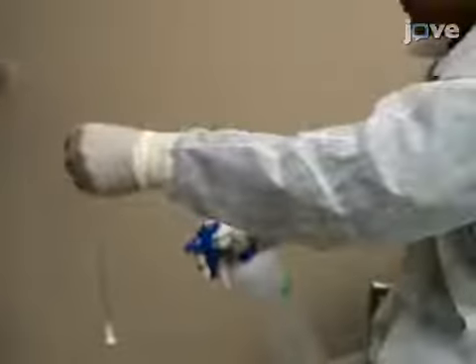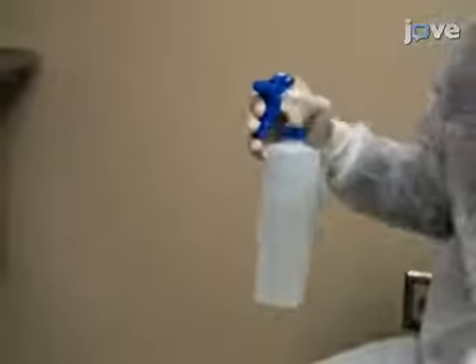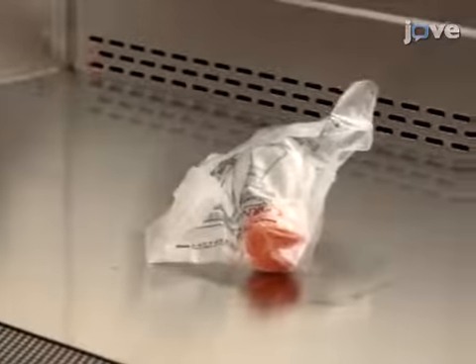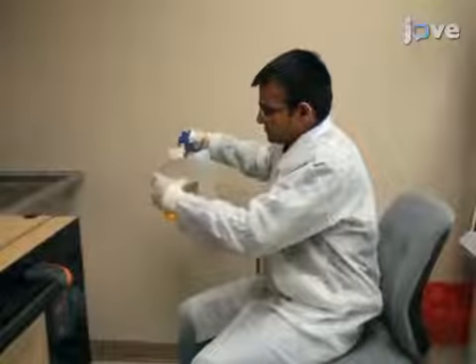Sterilize a 125 milliliter Erlenmeyer growth flask with a vented cap, pipettes, pipetters, and pre-warmed media bottles by spraying with a 70% ethanol and water solution. Place these items in the biosafety cabinet. Throughout this procedure, all items must be sterilized in this manner before they are brought into the biosafety cabinet.